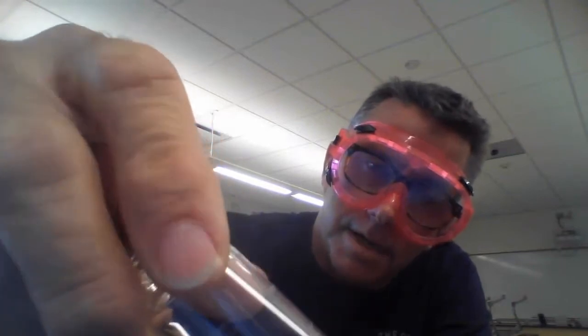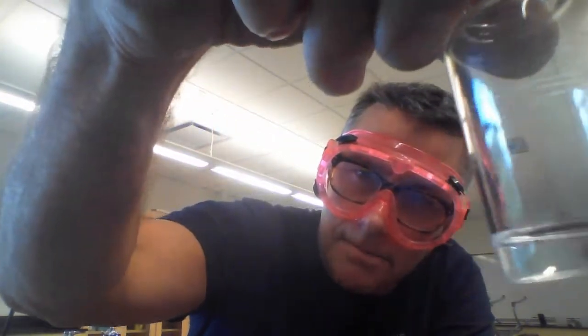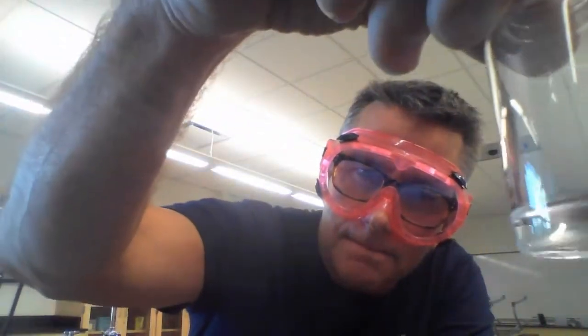Isopropanol, also known as rubbing alcohol. This one has 3 carbons in it in addition to an alcohol functionality. Maybe you can see that it has some greasiness to it. Maybe not. Oh, sharp.